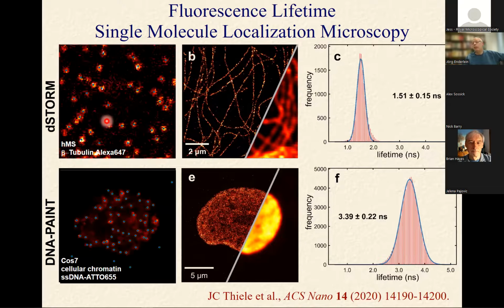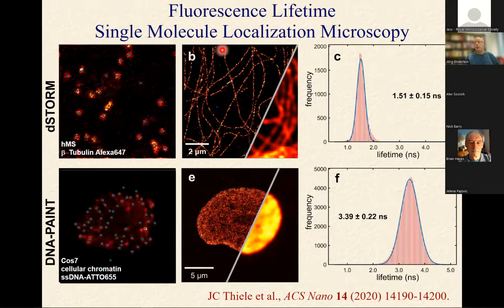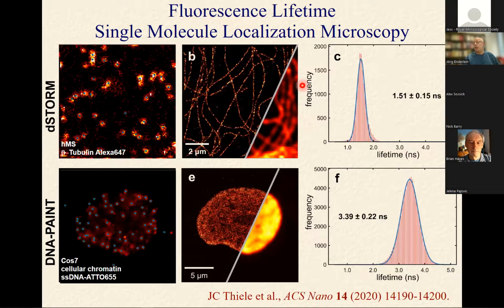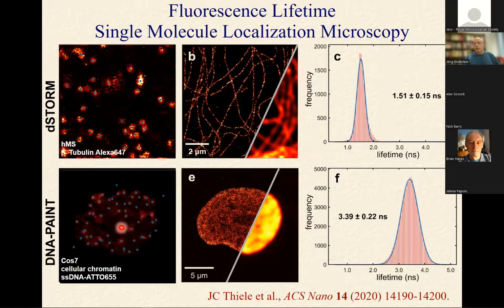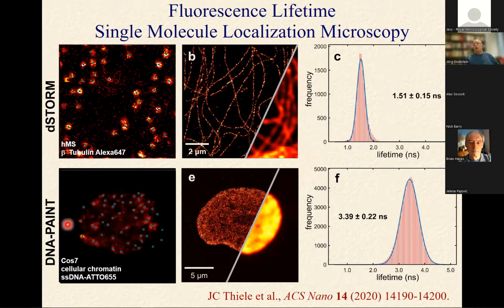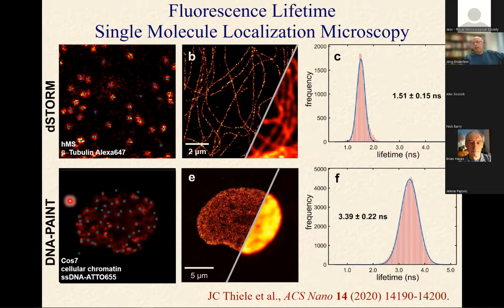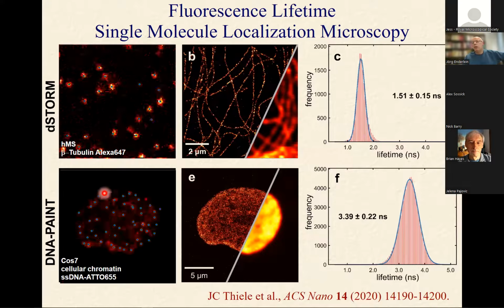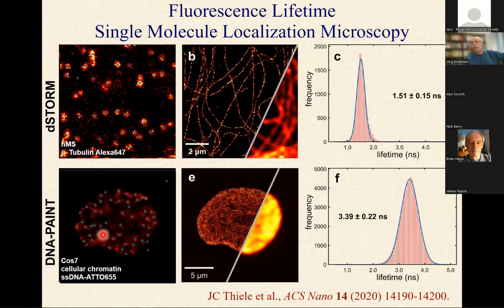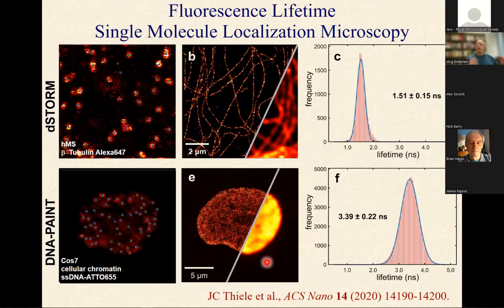This is shown in here, the comparison between the super resolved image reconstructed from single molecule localizations versus the normal confocal image. The same here. We use here another method, which is called PAINT. I will not go too much into detail. It's very similar to STORM and PALM, but it's even more clever and gives you even higher resolution. So this is here chromatin in the nucleus. And again, here you see the comparison between the super resolved image and the normal confocal laser scanning microscope for resolution.